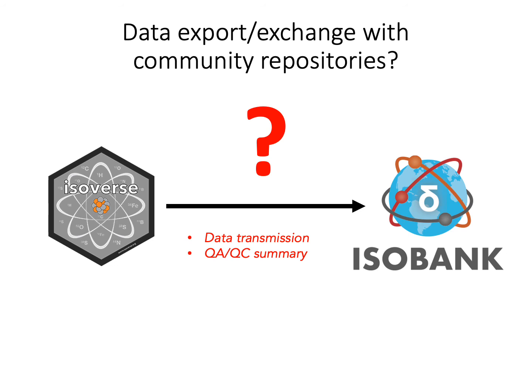As you can imagine, we're excited about how isoverse could tie into this kind of community effort and help users transmit their data, transmit information about their QA/QC procedures, what standards they used, how they standardized their measurements, and so forth. We are currently in the process of figuring out how that kind of collaboration might look, with a workshop earlier this year before the pandemic hit between IsoBank and isoverse specifically about that topic.